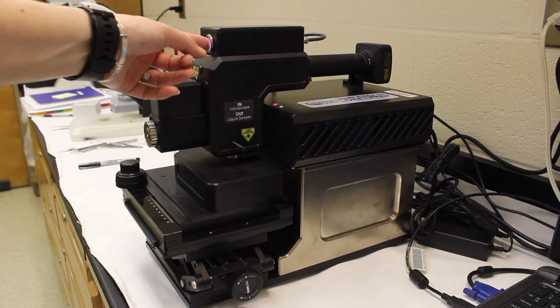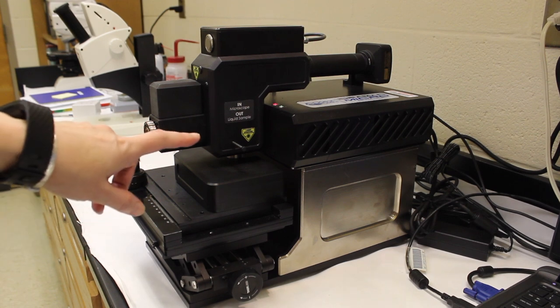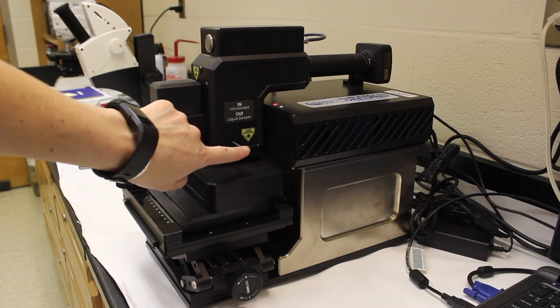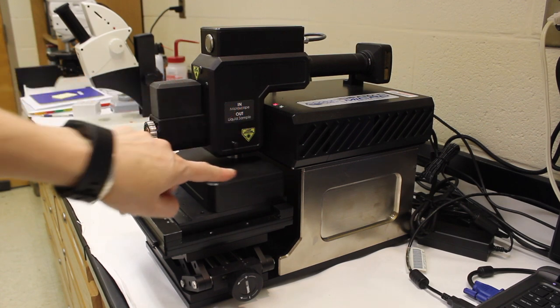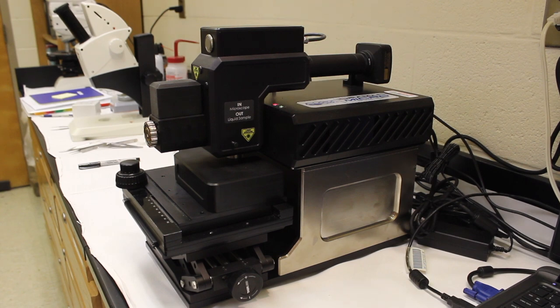Then we need to turn the LED light off for the same reason. We don't want the LED light shining on it while we're analyzing the sample. Then we put this toggle in so the laser goes into the microscope area and analyzes the material under the microscope.